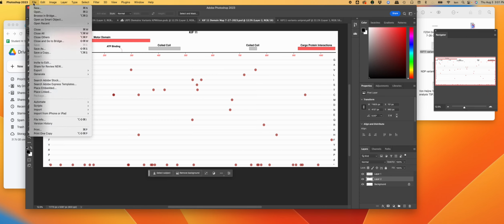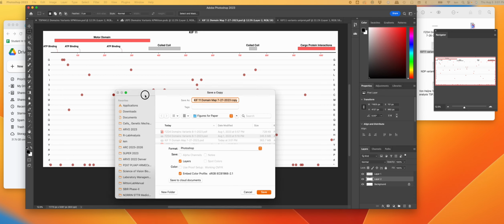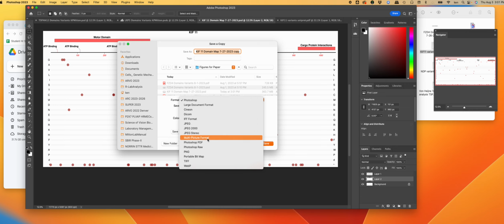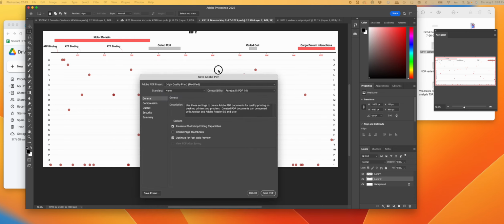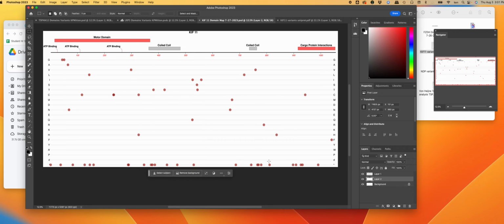I'm also going to save myself a copy, which is also I'm going to make basically a PDF export of it. So we have that too. I don't need that. There. So now I'll have this as both a Photoshop document should I need to alter it, and I've got a PDF version of this.